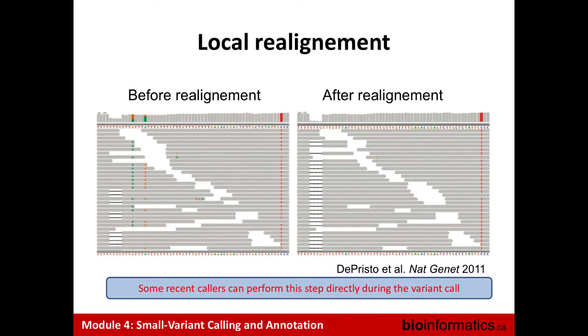And then what was the base recalibration correcting for again? So the base recalibration is correcting each base in the sequence to give it the correct quality number that it should have, depending on its position on the read and on the genomic context around it. Because the base quality is used in the Bayesian algorithm to estimate the probability of a variant. I cannot show you a cartoon to tell you how it works because it's more at the really back level, but it has an impact.